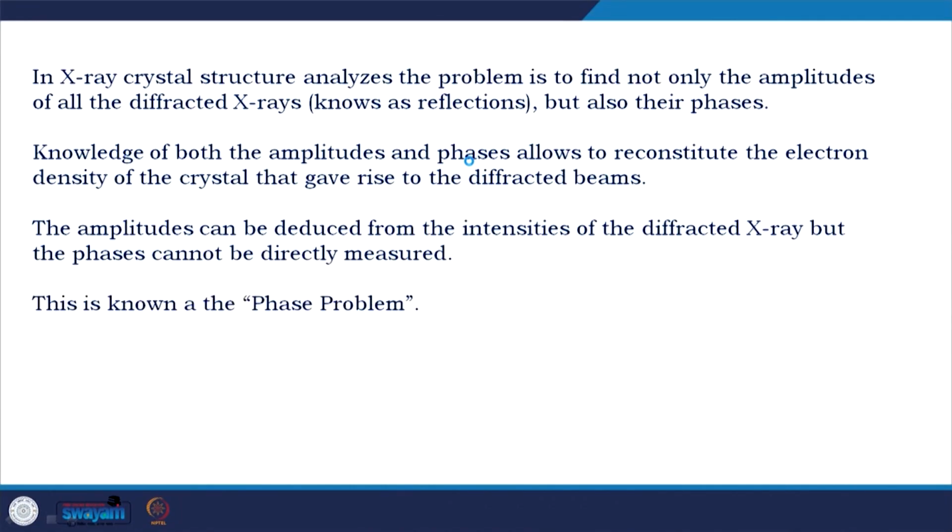But if you think of any ray or diffractive beam with wave properties, it could be in destructive phase or constructive phase. So, calculation of phase is very important, but it cannot be done through the normal X-ray crystallography experiment, and that is why it is called the famous phase problem.